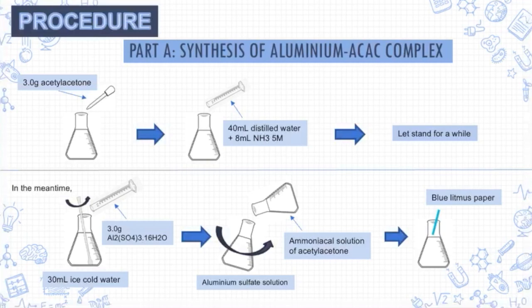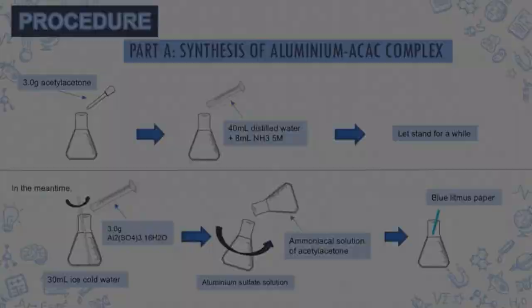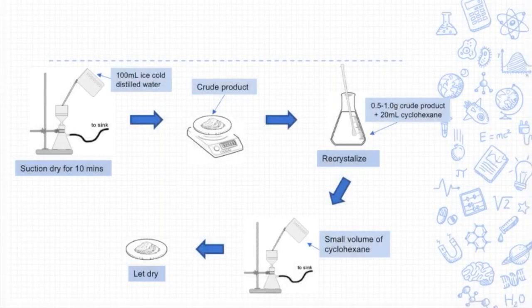After that, the pH was checked using blue litmus paper. The resulting precipitate was suction-dried. Next, a portion of the crude sample was recrystallized from cyclohexane. The resulting crystals were left to suction-dry and then dried thoroughly in air.